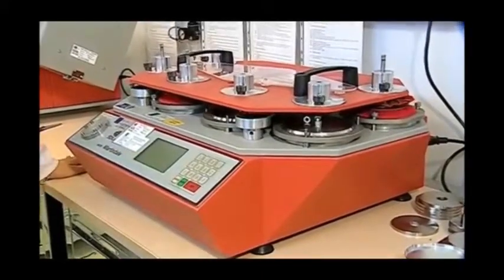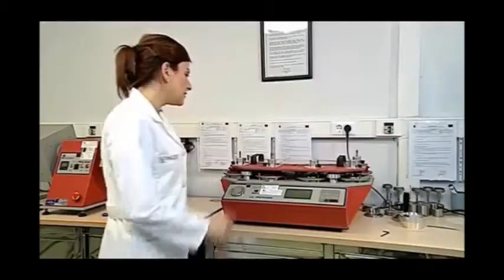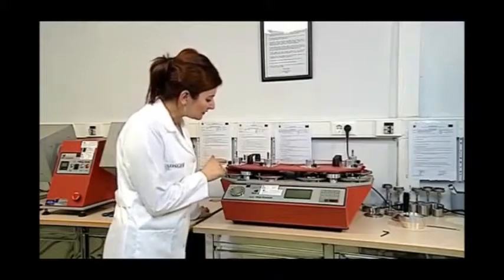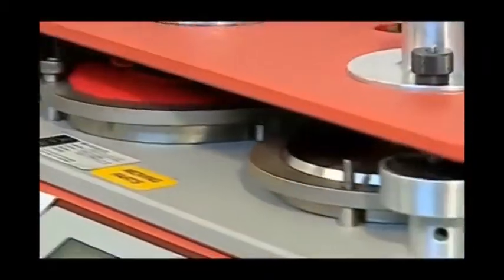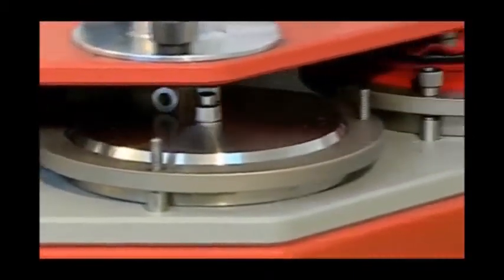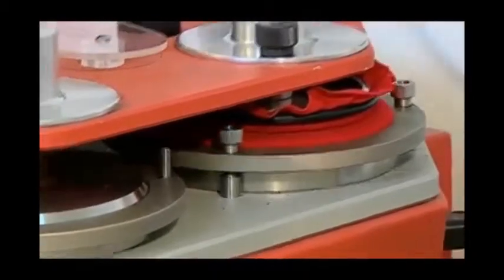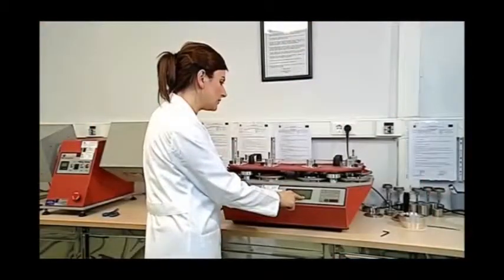The device is executed by pressing the start button. The device is forming Lissajous pattern, which is made of 16 scrubbing movements. When the number of abrasive rubs we entered is reached, the test device stops automatically.